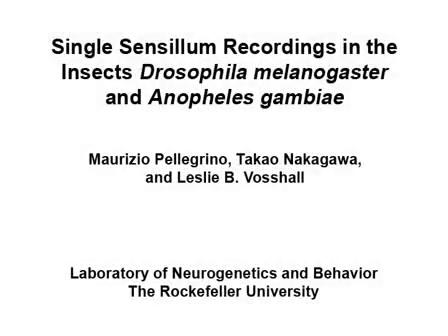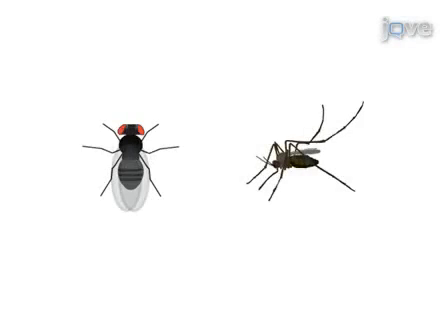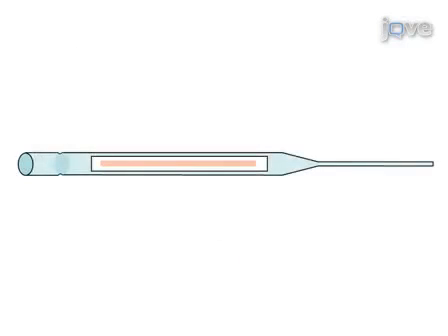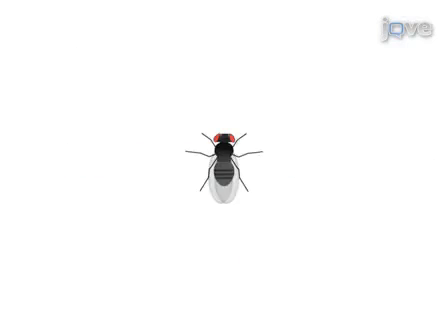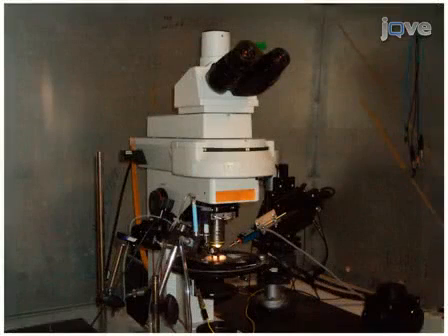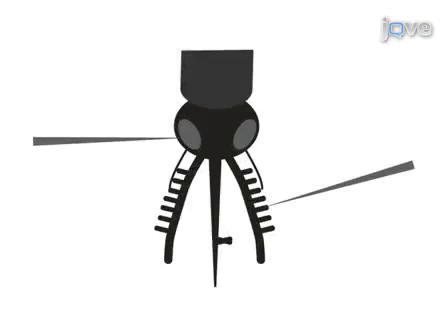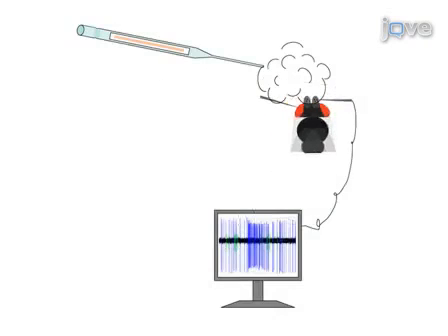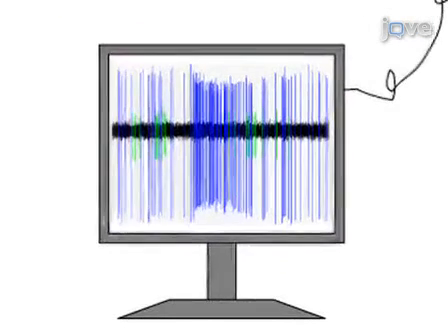This video demonstrates how to perform single sensillum recordings in Drosophila melanogaster and Anopheles gambiae. Prepared odorants are pipetted onto paper strips and inserted into pasture pipettes. Live insects are mounted to immobilize the olfactory organs. The insect is placed under a microscope, a reference electrode is inserted into the insect's eye, and the recording electrode is then inserted into an olfactory sensillum. An odor is puffed from the pipette to the sensillum and neuronal activity is recorded.